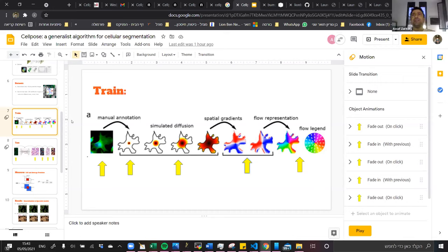Okay, yeah, I think it's a clever idea. I appreciate it now. Most of the segmentation algorithms, and all these mappings, are not very creative, computationally at least. And here I think it's very nice. We see here again the same ideas that we've seen with the Nucleizer. Diverse data is good, right? Which is not obvious, because you sometimes think it's better to specialize. A lot of data is good, and again, no parameters, which is critical. Segmentation with no parameters is very important. You don't want to start and tweak every small thing. And with that, I'm not saying that it's done.